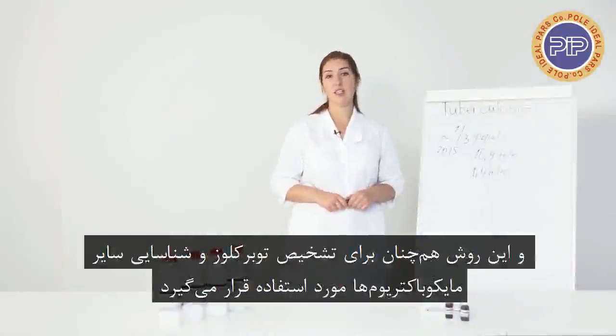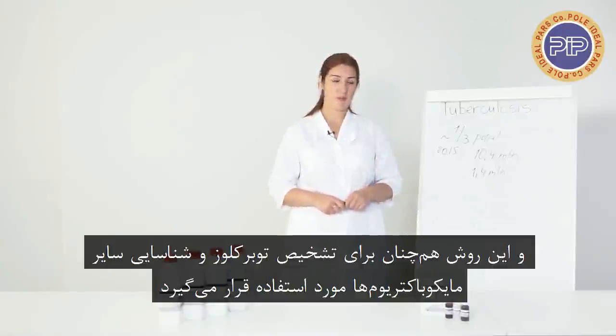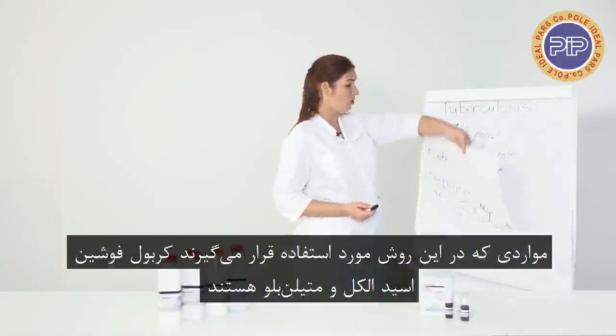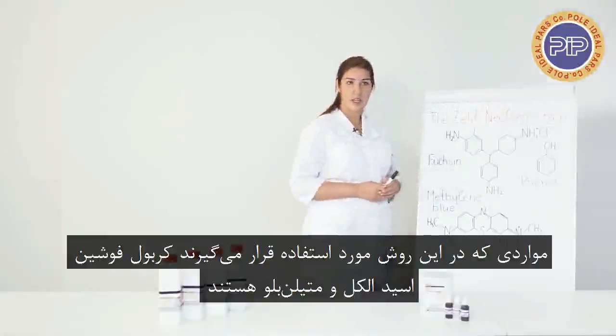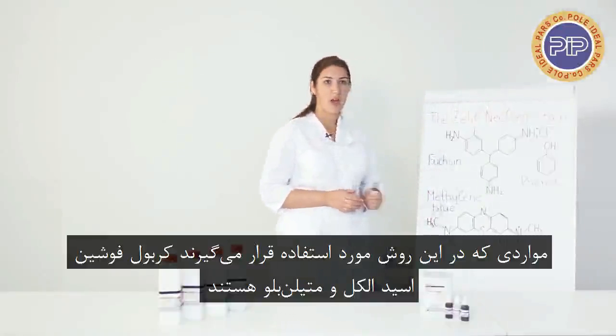Together, Franz Ziehl and Friedrich Neelsen developed a method for staining of acid-fast bacteria, and this method is used until nowadays in diagnosis of tuberculosis and to detect the presence of other mycobacteria. The reagents which are used in this method are carbofuchsin, acid alcohol, and methylene blue.